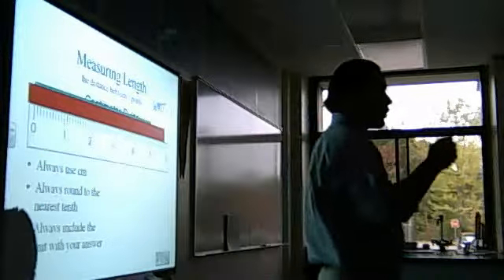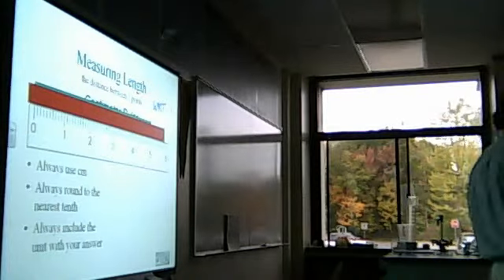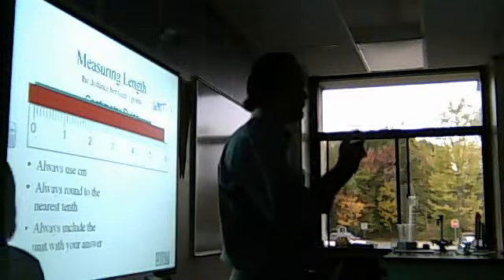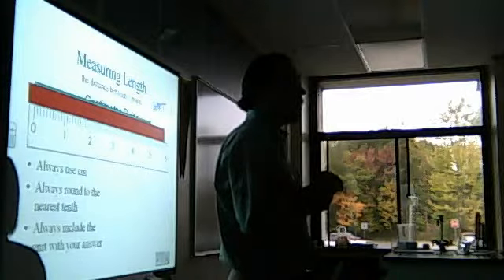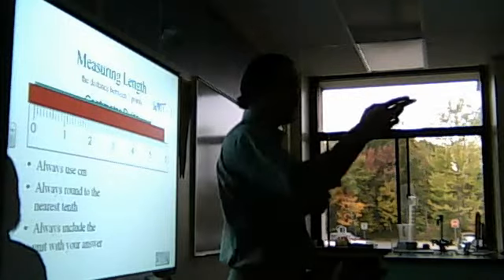All of these are forged from the same place. They all range from 2.4 to 2.6 centimeters. So if your range is in there, you're probably fine. What did you guys have? 3.0. Good. You have an issue, and your issue is that you rounded to the nearest whole number, because there's no way it's 3. I'm not joking. Feel free to try to measure it with them.